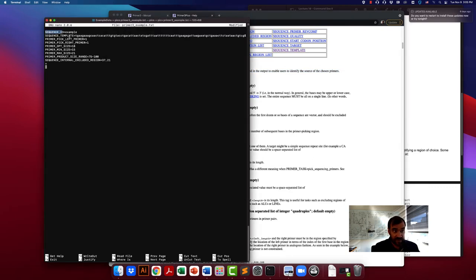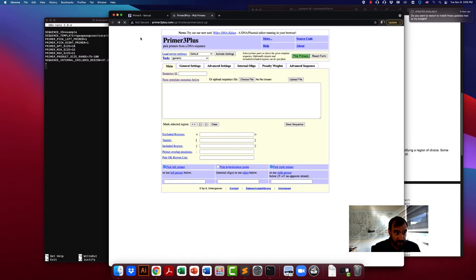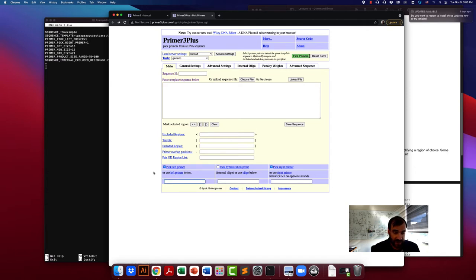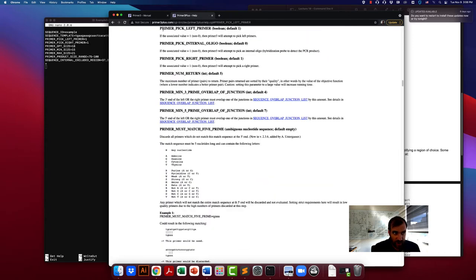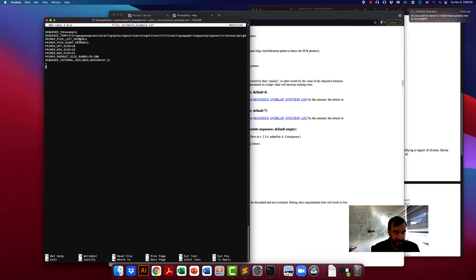SEQUENCE_TEMPLATE equals this, and then I provided it with the name of the sequence. A lot of times you can just click on the link and it'll provide you with the name of that argument. For 'do I want to pick the left primer' — that's a default option. You can actually specify a primer; for example, you might only want to pick a right primer. PRIMER_PICK_LEFT_PRIMER equals one — the one is a boolean true. So we specified that we want Primer3 to pick a left primer and a right primer.